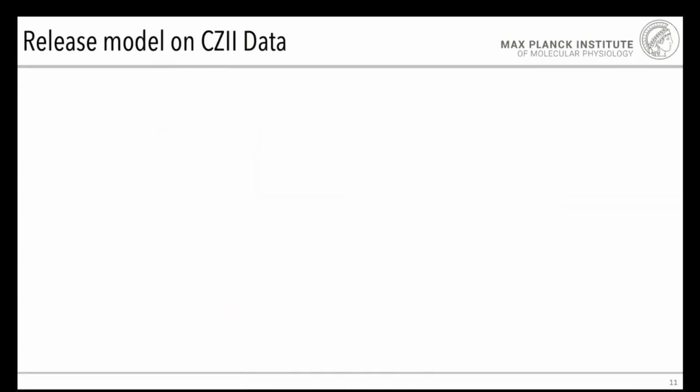So, what you probably care about is how TomoTwin actually does on the CZII data. One of the questions was, did you apply TomoTwin to the competition? And the answer is yes. It was really hard not to because you did such a nice job in making a TomoTwin notebook that people could just run. I'd say that TomoTwin was never really designed for this kind of competition because in the Kaggle format, you're never going to embed 500 tomograms in 12 hours. That's a different story, but we can still run it.